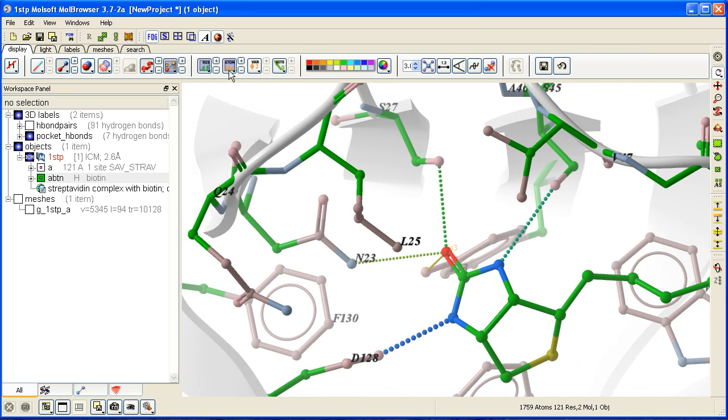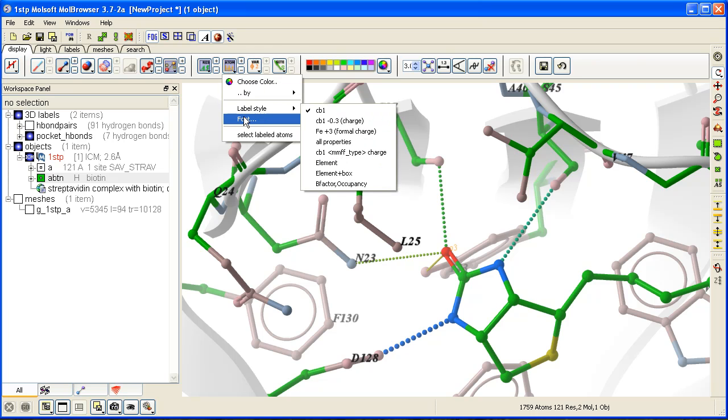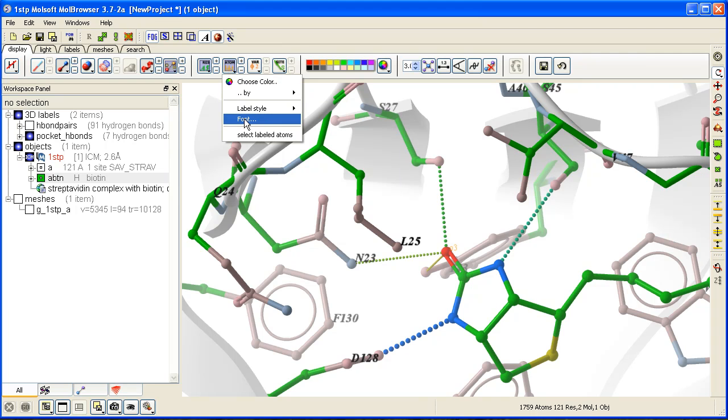You can change the size and font by clicking and holding on the atom label button in the display tab.